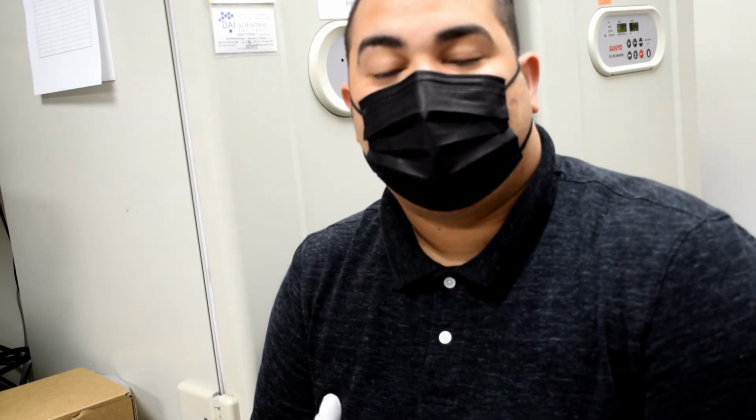Okay, so now let's get started with our cell culture experiments. Like I mentioned, I'm interested in how steroid hormones might influence prostatic fibrosis. So what I'm essentially going to do is take some cells, grow them in a flask, and wait an appropriate amount of time for them to grow happily in media, which provides the nutrients the cells are going to use to grow. Once they grow to the amount I want and are ready for the experiment, I'm going to treat them with different doses of 17-beta estradiol, or E2, which is a type of estrogen. After that, I'm going to collect the cells, lyse them, and look at different changes in protein after treatment. I'm also going to be looking at what genes are activated after I treat them with the estrogen, and I use them for my project specifically.